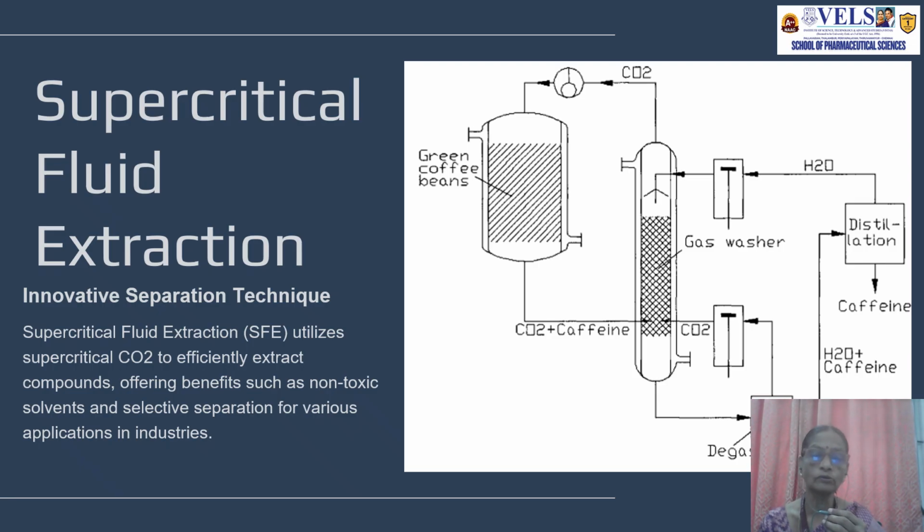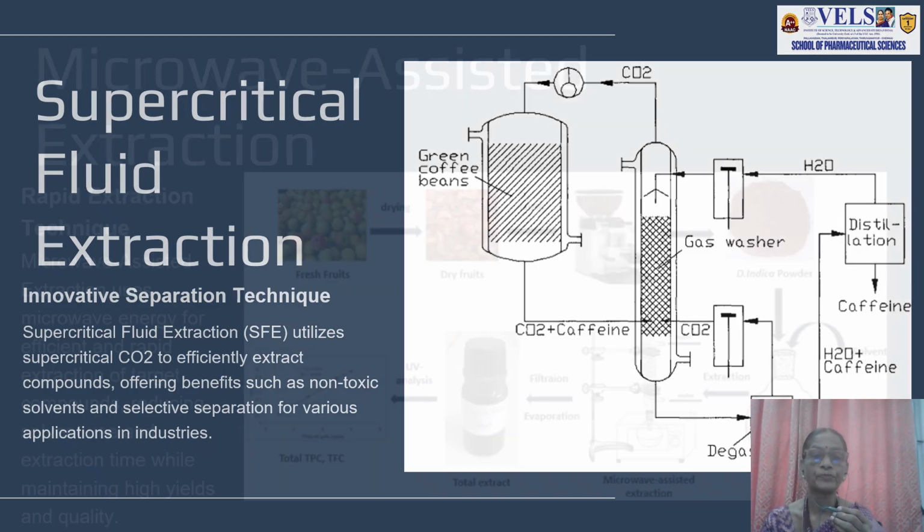Mostly, this supercritical fluid extraction is a less time consuming process, more efficient, and eco-friendly. There is no need for solvent. We can use any inert gas as a supercritical fluid.